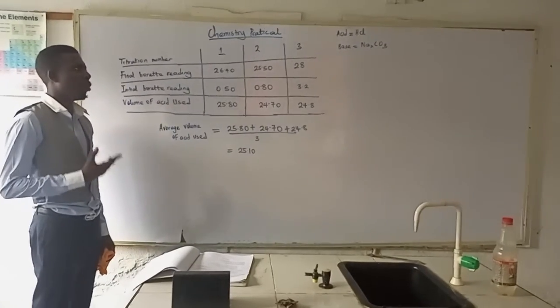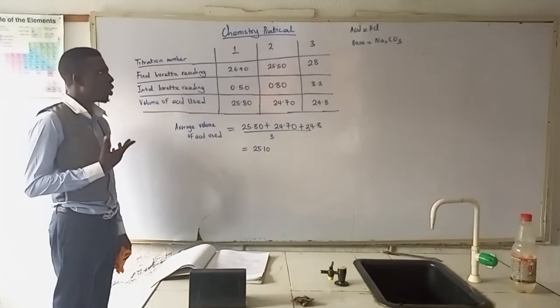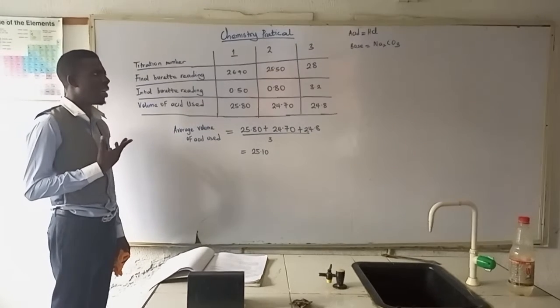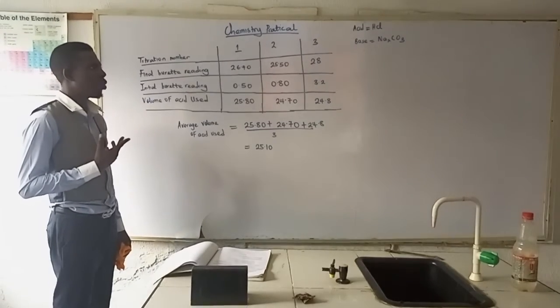Remember that this table will be provided in the examination question, but the question they ask us to answer is to identify the errors present in this particular reading.